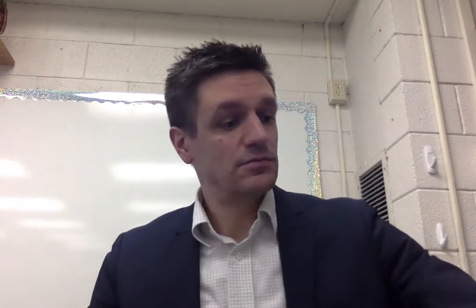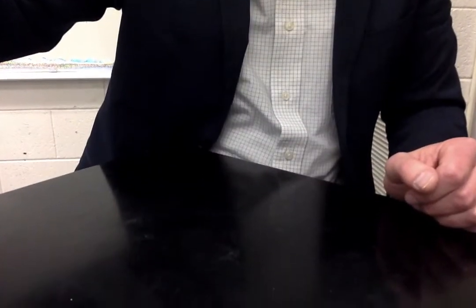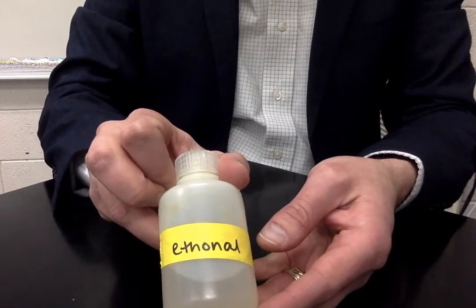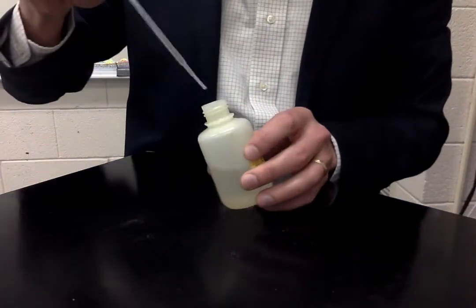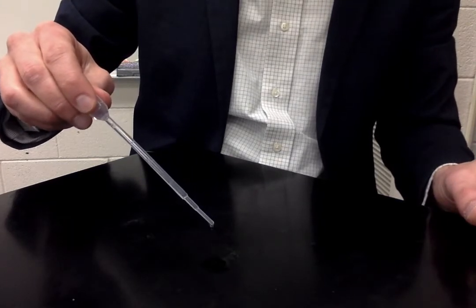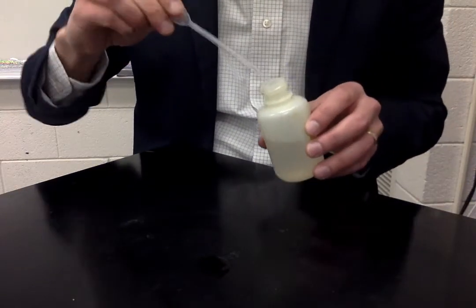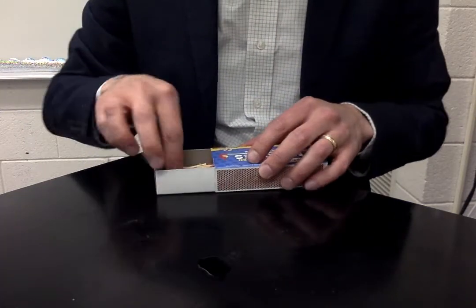So pause the video as needed, and I'm going to go down to the counter because that's where our fires are. First one I'm doing right now is ethanol. This is letter A. That was 10 drops. And here comes that fire.